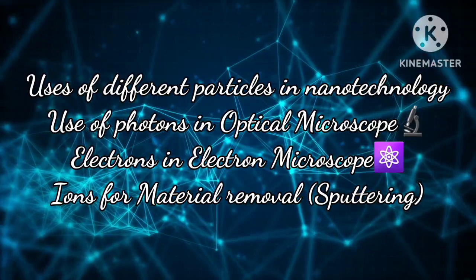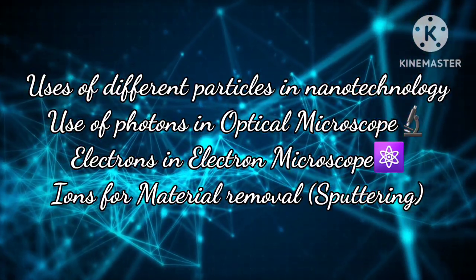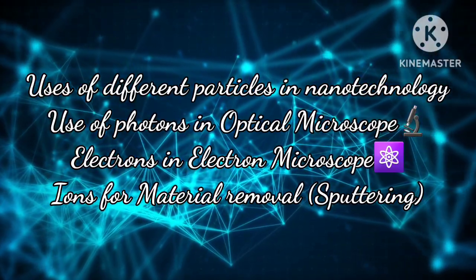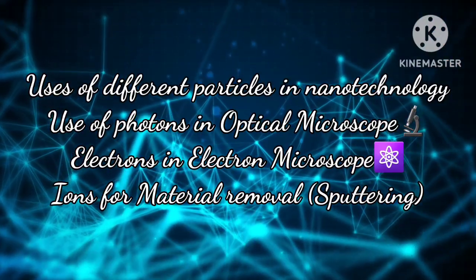An optical microscope uses photons for generating a magnified image of an object. It uses a light source that emits photons towards the surface of an object. But an optical microscope magnifies an object to the range of micrometers but has failed to enter the nanometer range. But there is a different use of an optical microscope, other than magnifying objects, in nanotechnology that I will tell in the upcoming videos.